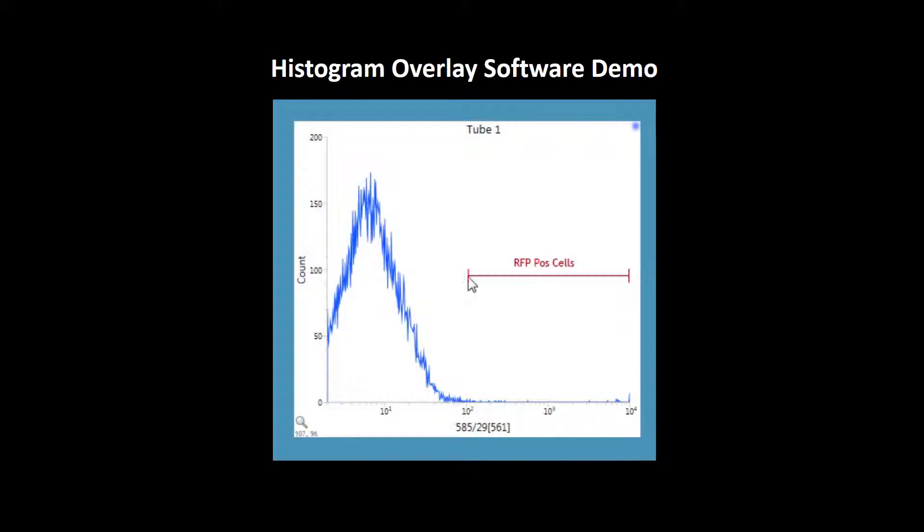This is unstained and I have put a gate here as an RFP positive gate. Whatever RFP positive cells come, it should show in this plot.